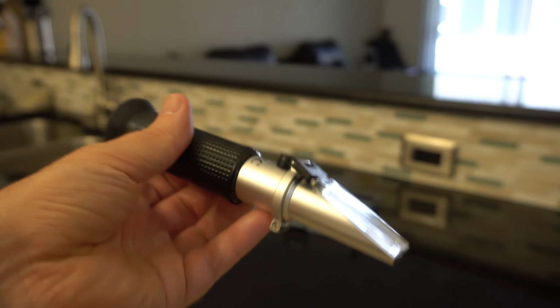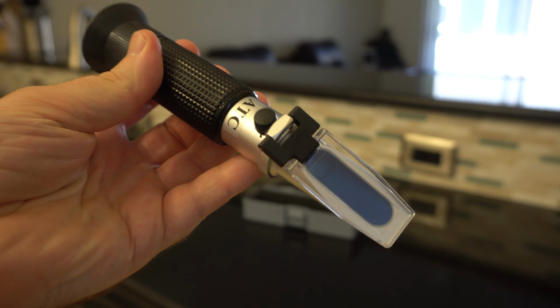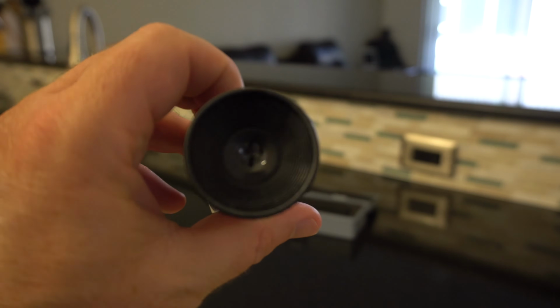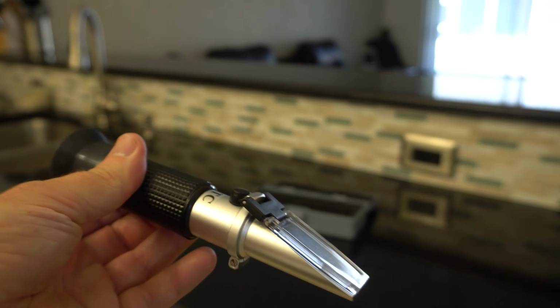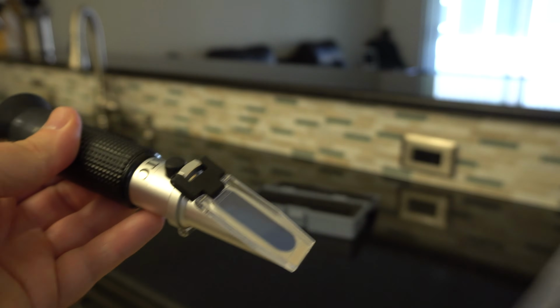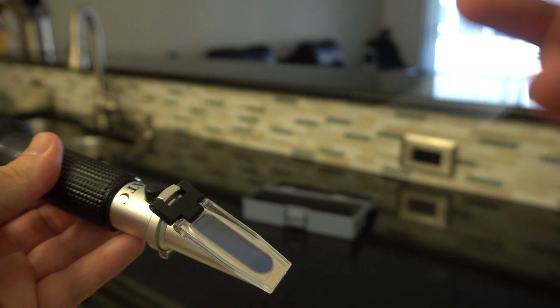The other is a refractometer, which sounds fancy, but it isn't really. After all, it's just a piece of glass and some plastic. They're not too expensive either. One like this can be purchased for around $20 US. It uses a prism to measure the amount of sugar in the liquid and report it in degrees Brix.